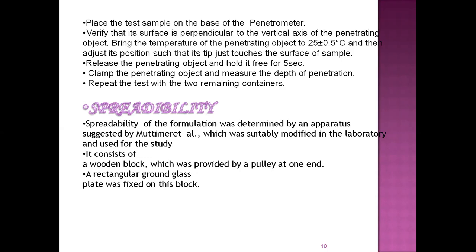Then the spreadability, another one. The spreadability of the formulation was determined by an apparatus suggested by Mutimer et al., which was suitably modified in the lab and used for the study. It contains a wooden block provided with a pulley at one end, and a rectangular ground glass plate fixed on this block.